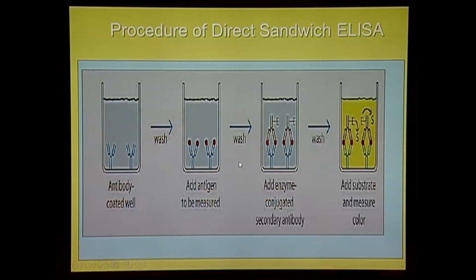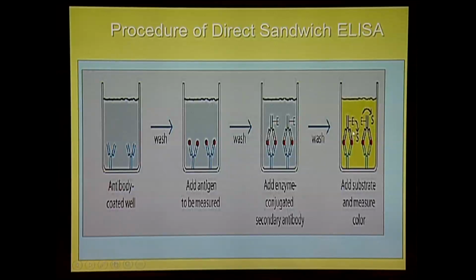Here the second antibody is generated against a second epitope of the same antigen. Now, if the sample is carrying the antigen, then the sandwich will be formed, and upon the addition of the substrate it will change its color, and we can see whether the antigen is present in the sample or not. And quantitatively we can detect the presence of the antigen by measuring the intensity in an ELISA reader. And this is an example of direct sandwich ELISA, since the antibody which directly binds to the antigen is tagged with an enzyme.